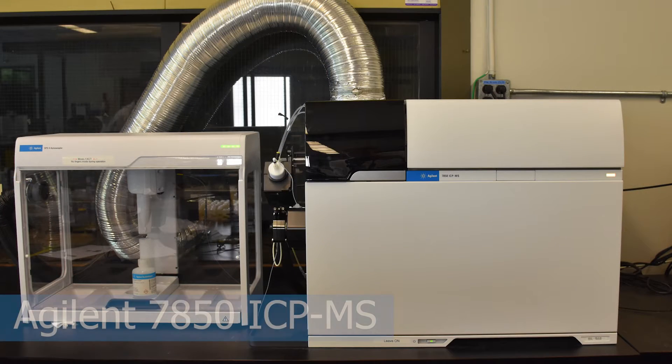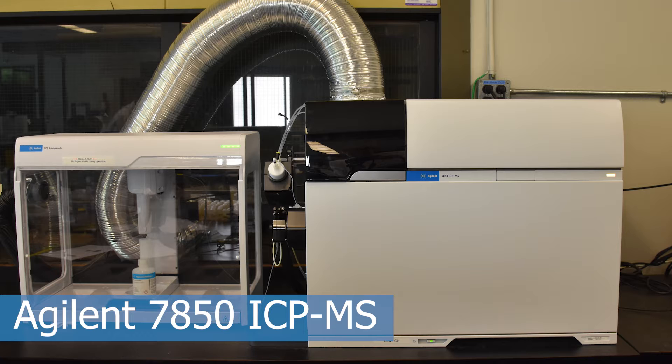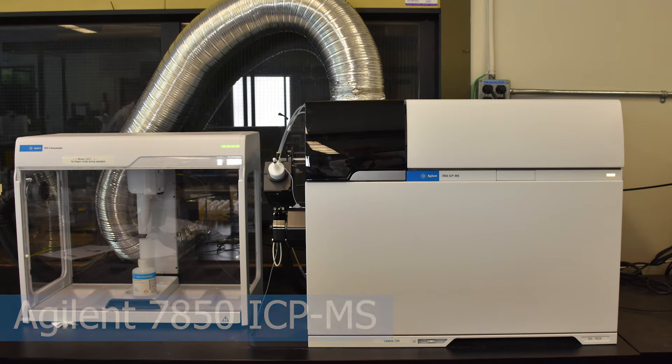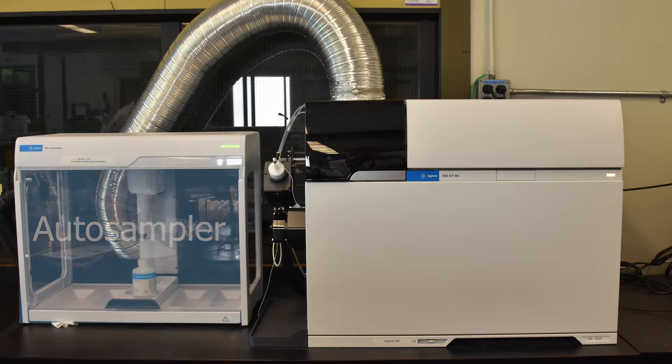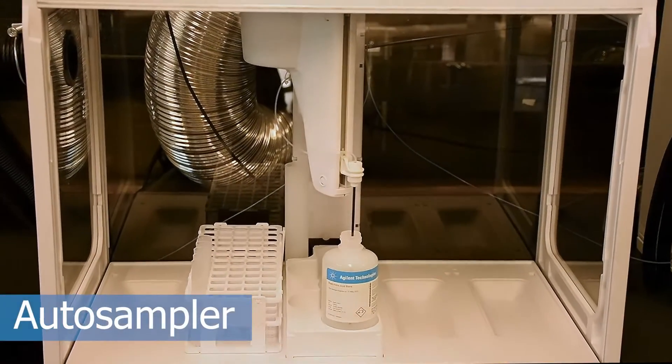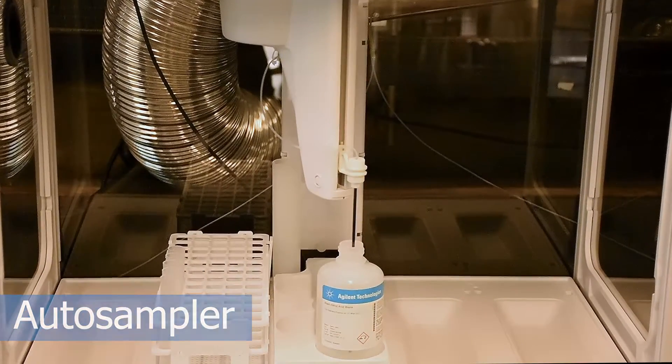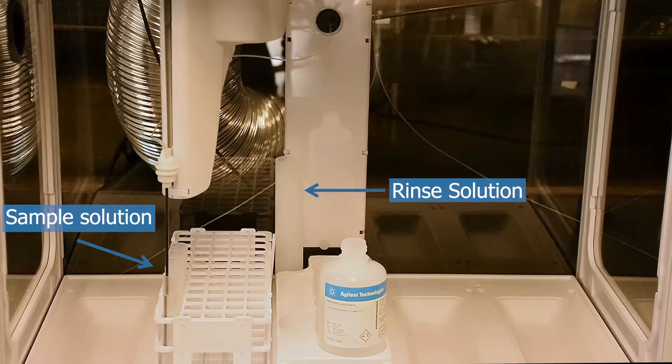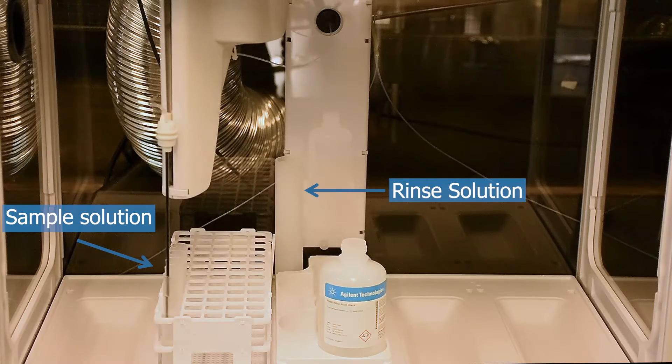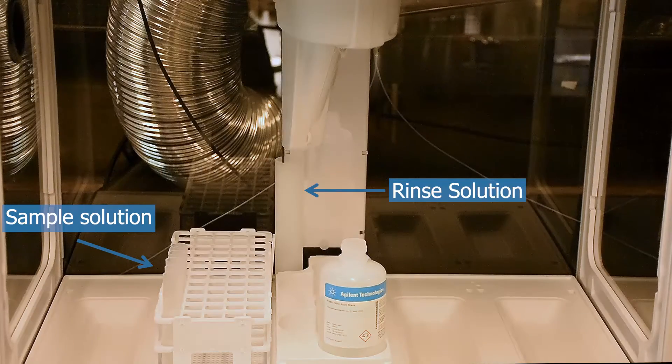The instrument that we are looking at is the Agilent 7850 ICP-MS. We will begin by looking at the autosampler. Samples are loaded into the autosampler, and a motorized sampler arm draws the solution into the instrument. A rinse solution is used between samples to limit cross-contamination.